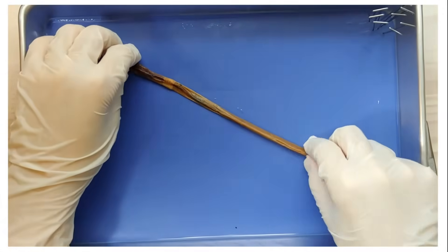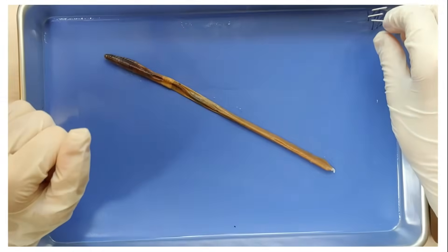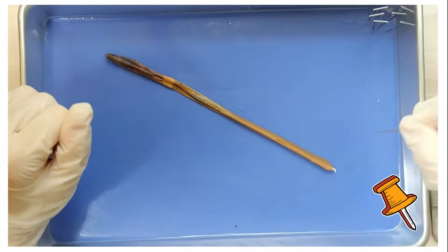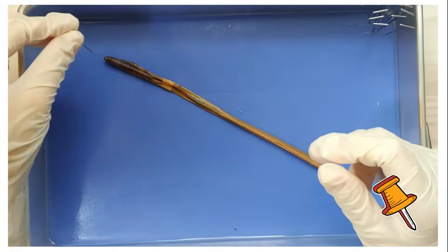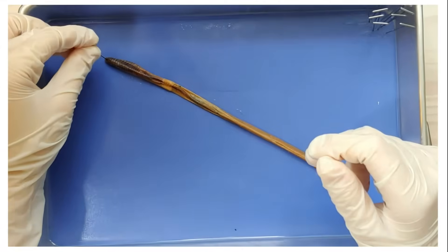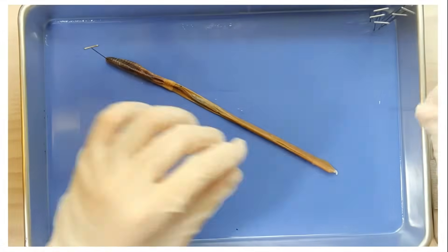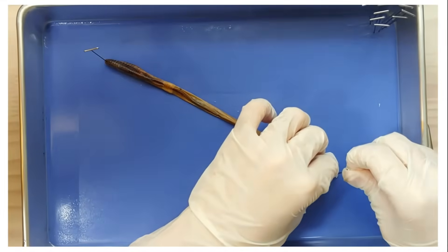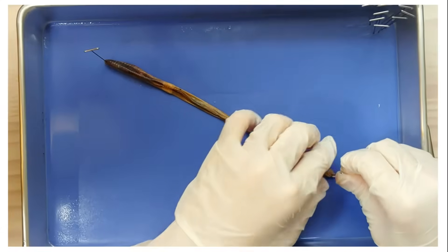Now the first thing I'm going to do is pin the worm diagonally across the dissection tray, first at the head and then at the end of the tail. This makes sure that it doesn't move around too much when I dissect it.